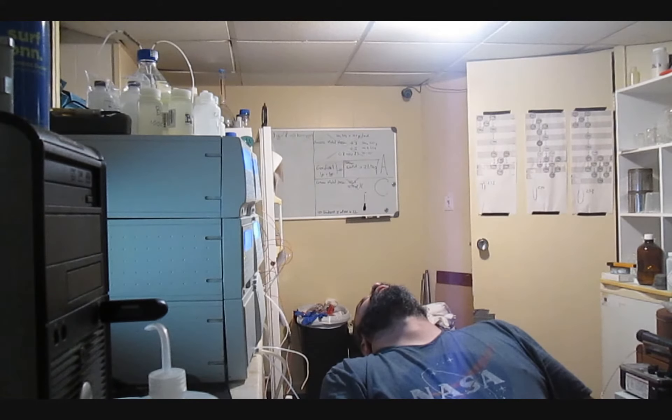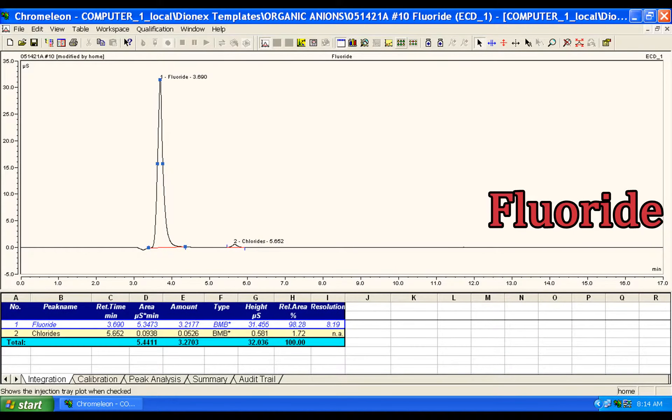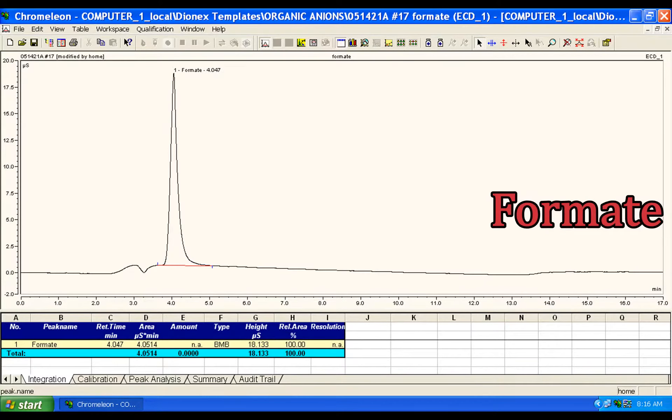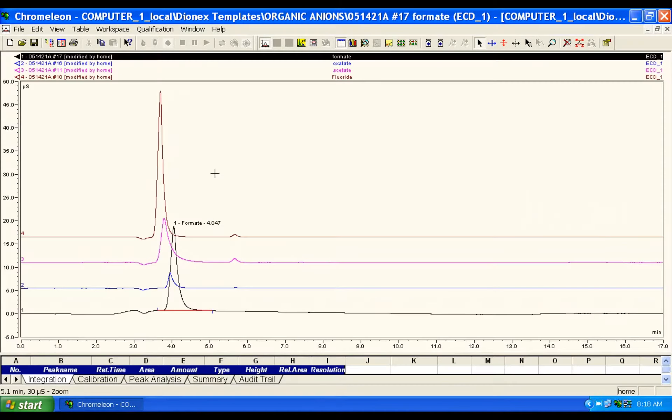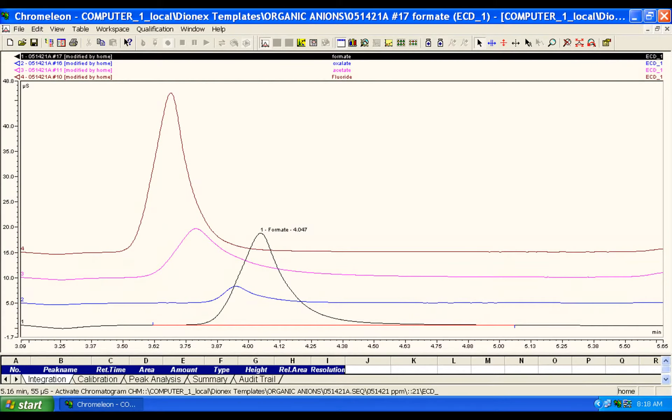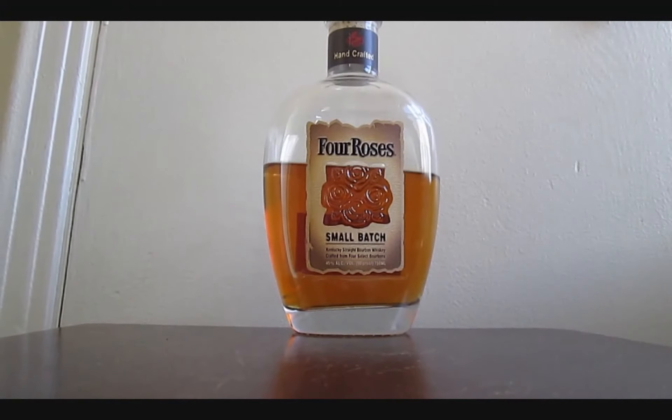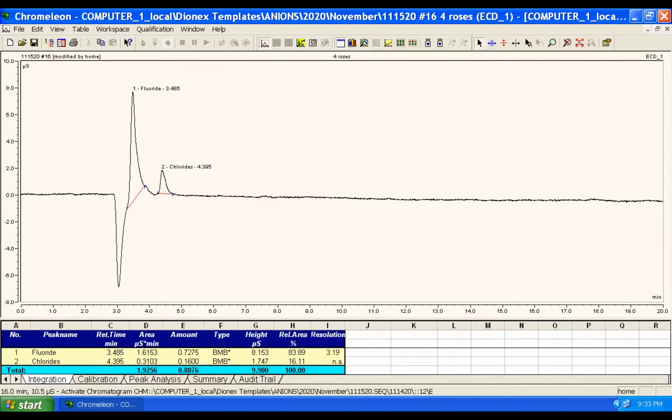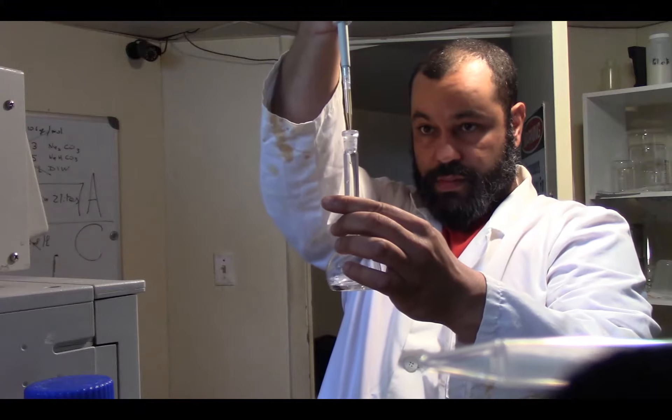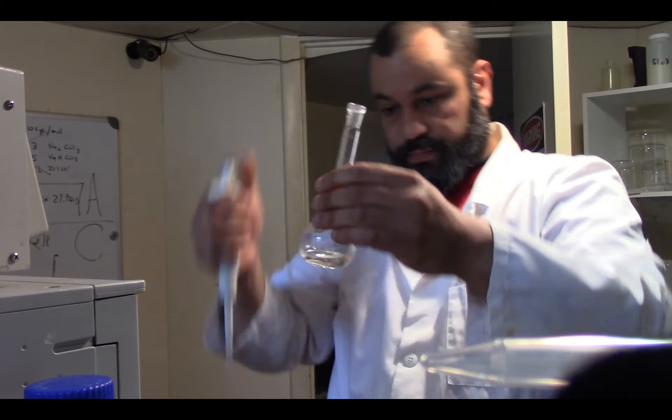Since fluoride and some organic anions come out at the same time, I had to play with the mobile phase concentration and try to separate them like I did with the cation in part 5 of this video series. And here's three commonly found organic anions overlaid with fluoride right there. So if a sample has a lot of organics and no fluoride, or vice versa, one could easily be mistaken for the other. With that in mind, I re-analyzed some whiskey, and here's the result.